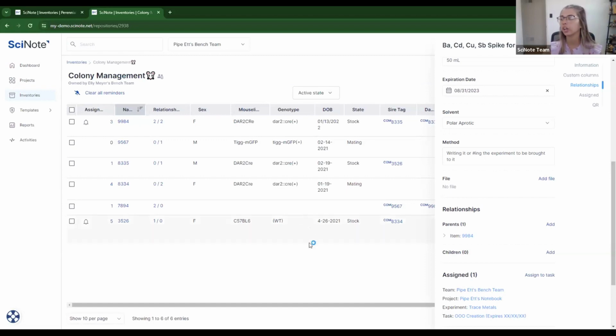So I highly encourage you to check it out and give us some feedback. Tell us what you like about the new feature and tell us maybe what you don't like or what you want to see added. Because as I've probably been mentioning a lot, your feedback does drive how SciNote is going to move in the future.